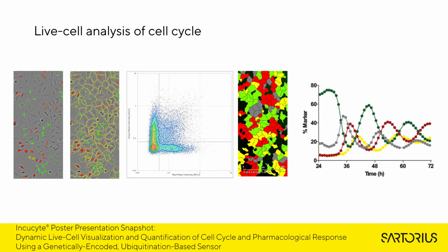Using a 24-hour thymidine synchronization protocol, HeLa cells were arrested in the S-G2M phase of the cell cycle. In the plot, you can see the population is held in the green phase in the early time section of this plot. Upon release of the thymidine block at just past 24 hours, the cell cycle progresses through M, G1, and then back through SG2M. Using this type of analyses, you can determine the cell cycle, in this case about 17 hours, which is the peak-to-peak duration.